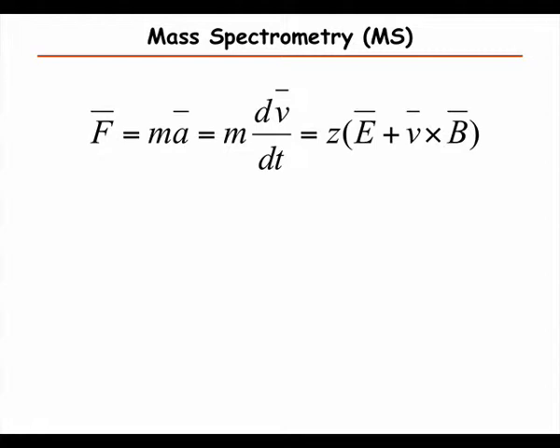Oh, but before that, with any mass analyzer, you use a combination of electric fields. So you have an electric field and a magnetic field, and I don't know if you're familiar with this, but the force is equal to mass times acceleration.